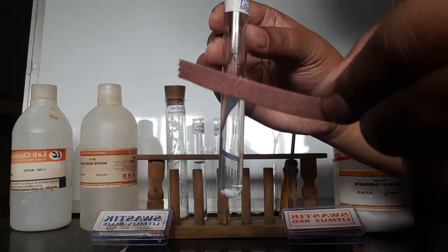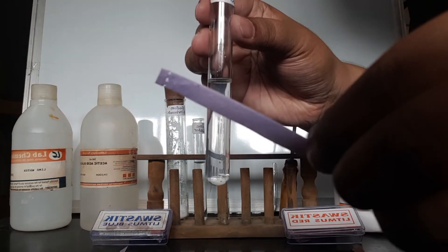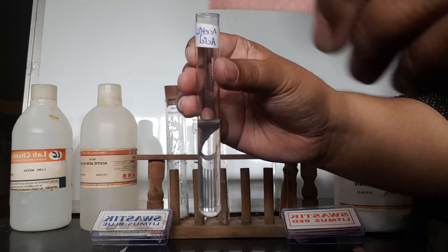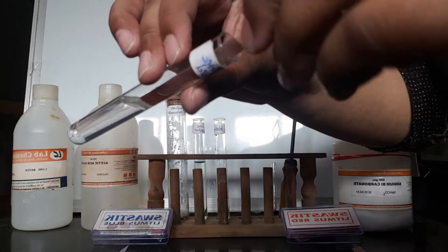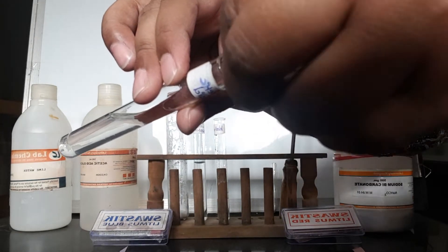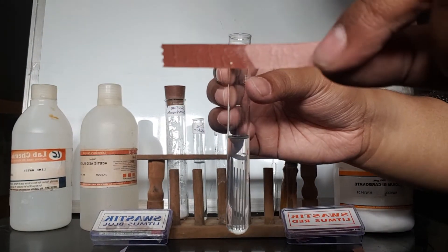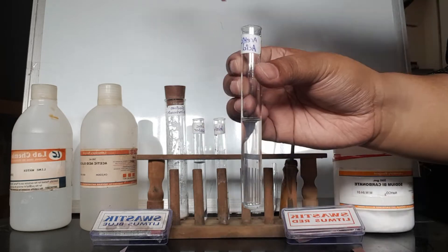Now we have to test this acetic acid with red litmus paper and blue litmus paper. When we dip a red litmus paper in acetic acid, there is no change — no color change on the red litmus paper.